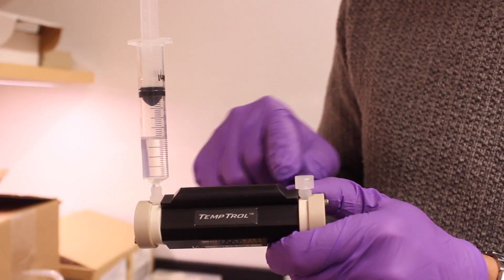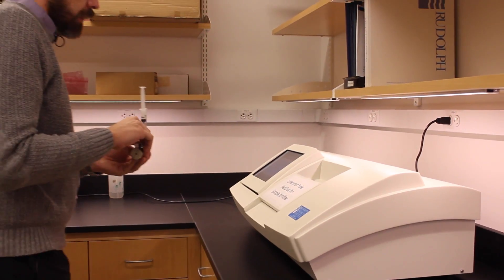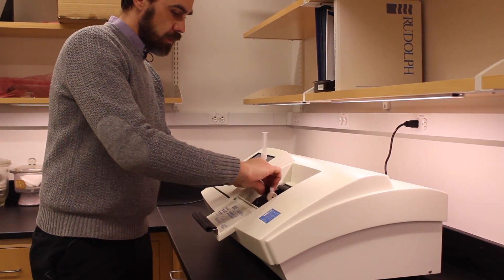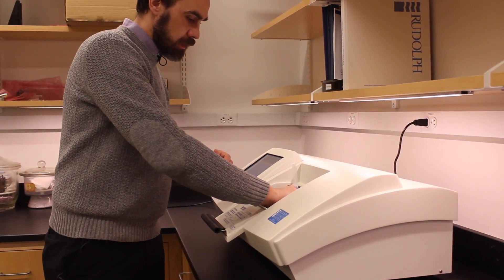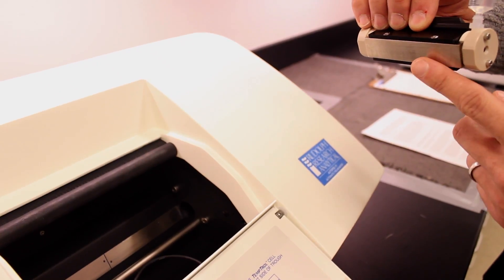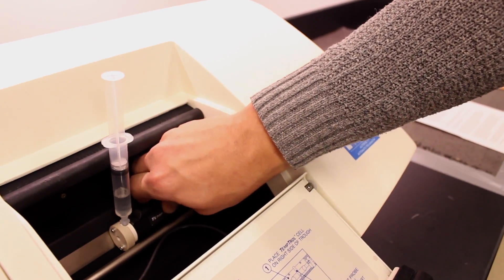Place a plug in the open port of the cell to avoid spills and evaporation during measurement. You can leave the syringe attached to the cell during measurement. It's a good idea to put the cell into the polarimeter first in order to give extra time for temperature equilibration while you're setting up your measurement. The polarimeter cell should be placed on the sample rail with the metal plate of the cell in contact with the metal plate inside the polarimeter — this plate provides temperature control.